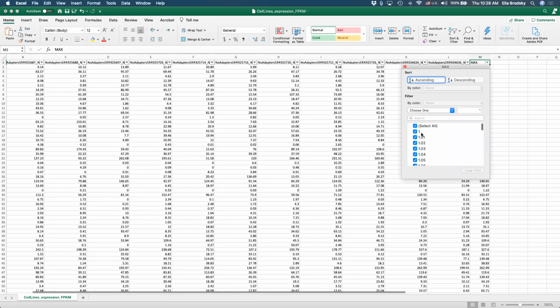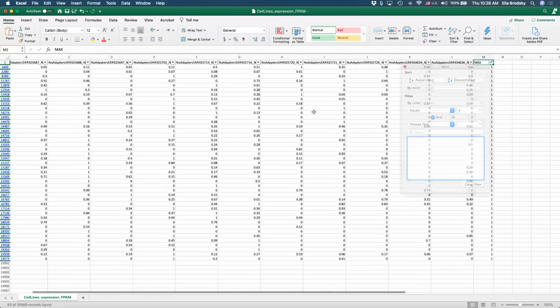You can see that the numbers start from 1, which means this is already a filtered set. There's not a single gene with 0 here, probably because the few with 0 expression were removed. That also happens if you take the ultimate raw output: you will typically have a number of genes that have 0.